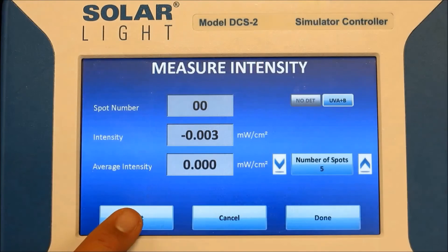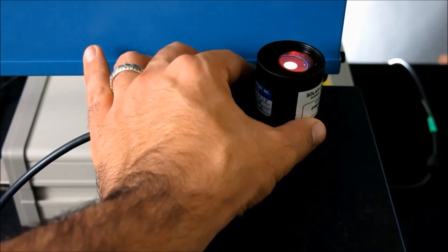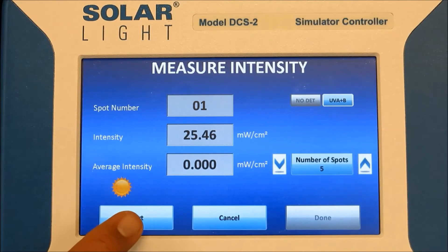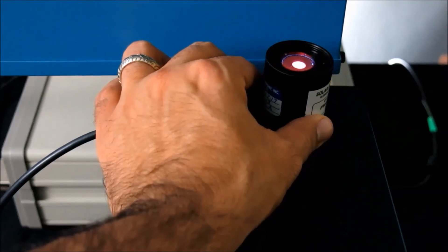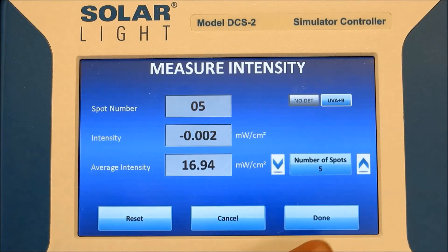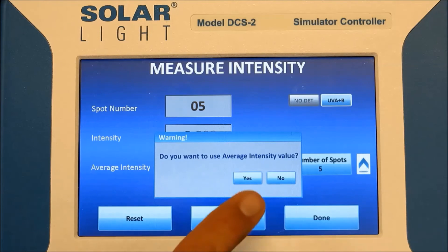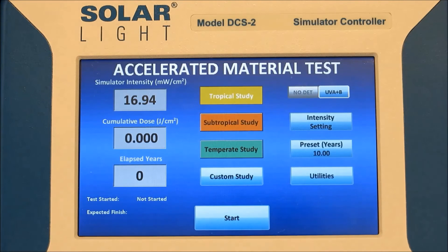The simulator shutter will open and the intensity will read in milliwatts per centimeter squared. After the intensity reading stabilizes, which takes a few seconds, press stop on the DCS-2 and move the sensor to an outer edge of the beam. Now we're on position 2 — press start, watch the reading stabilize, press stop, and move to position 3. Repeat this process for positions 4 and 5. At this point the simulator shutter is closed, and average intensity is displayed from our five measured spots. This completes the measured intensity, and we can hit done on the DCS-2.